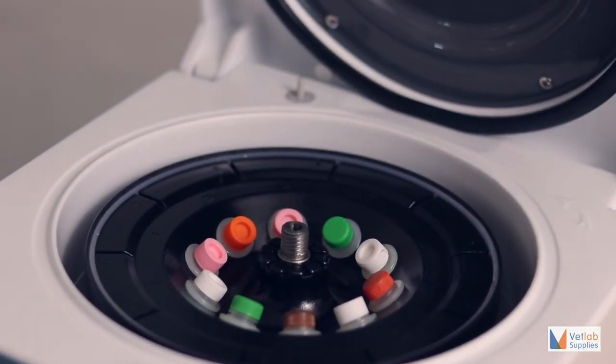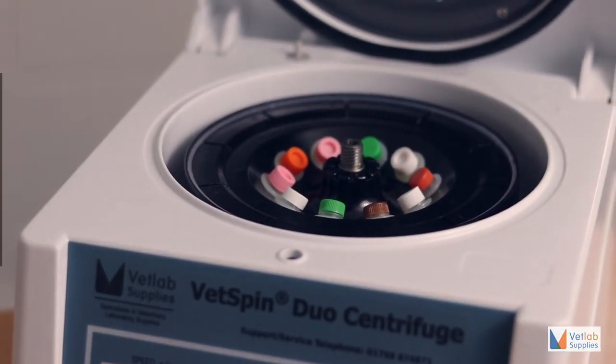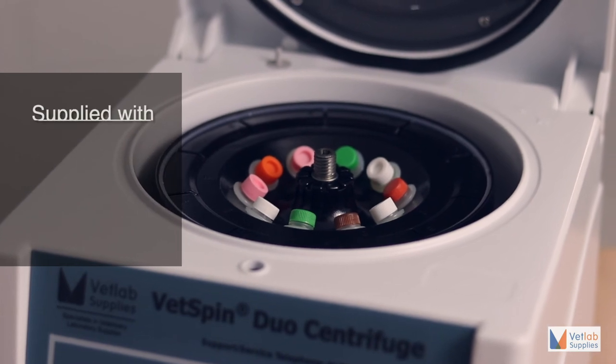Above all, with virtually no maintenance required, the VETSPIN DUO veterinary centrifuge is ideally suited for busy practices and laboratories.